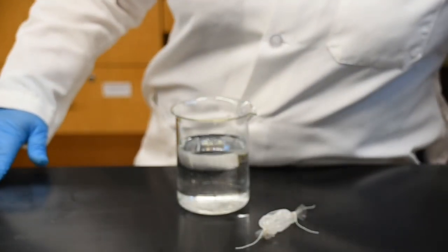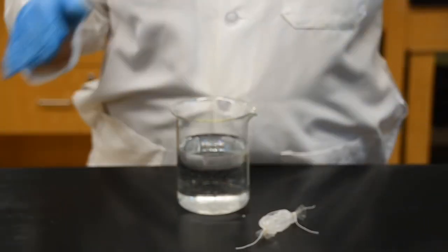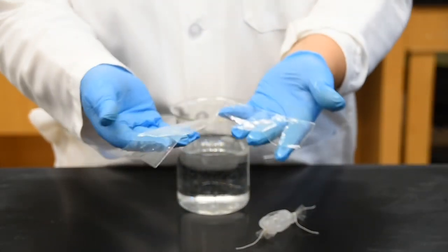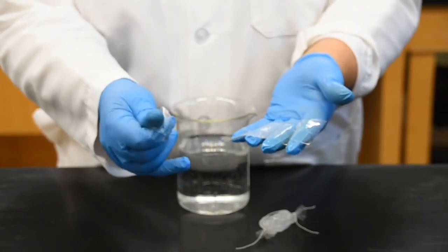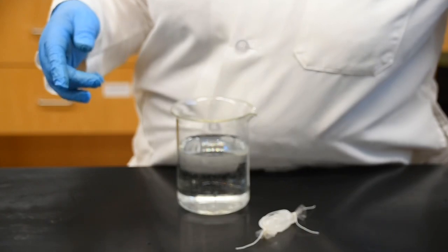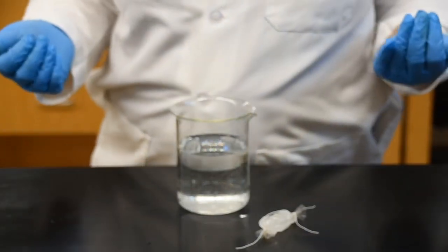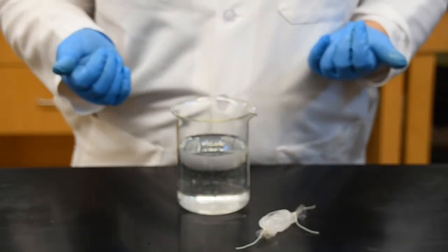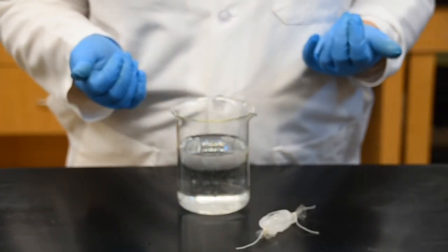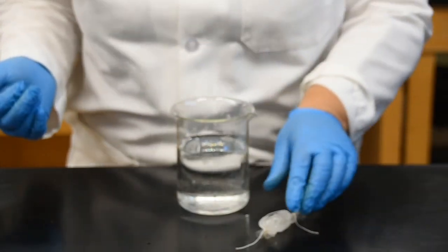Normally what they would look like, I'll show you a piece of this. It kind of looks like plastic bags, tiny plastic bags, and you can open them up. We usually keep these dialysis bags hydrated, and we can use them to see if molecules can pass through them as they act as our artificial cell membrane.